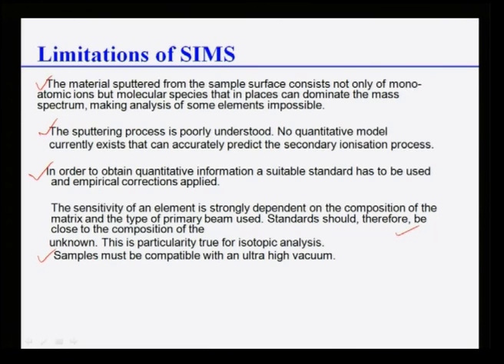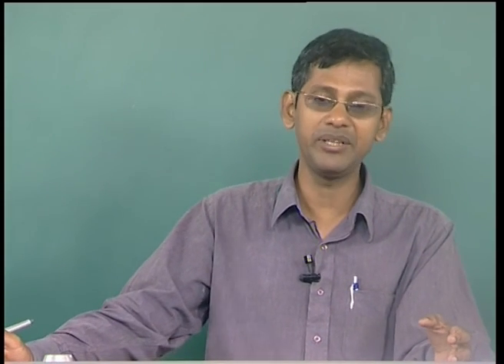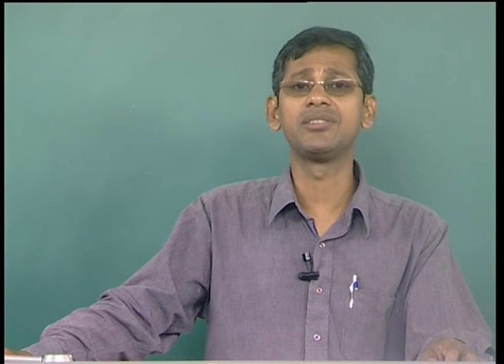Lastly, the samples which we are analyzing must be compatible with high vacuum. It should not degrade inside the vacuum system, because you are using a very high vacuum system, 10 to the minus 9 to minus 10 torr. Under that vacuum, it should not transform or degrade into something else. That is basically a big limitation. Otherwise it has many advantages, and with this I close this discussion on SIMS. The only thing I need to do is to compare these three surface characterization techniques, XPS, Auger and SIMS, and tell you how these techniques can be used in different things.